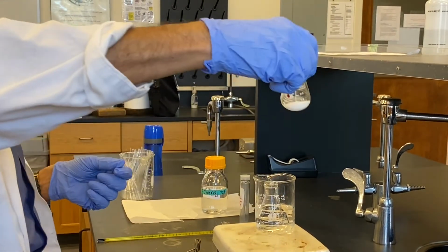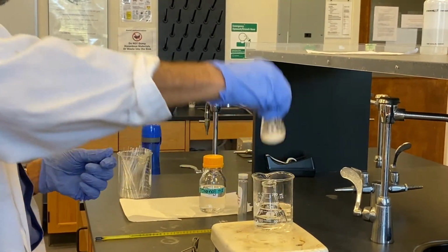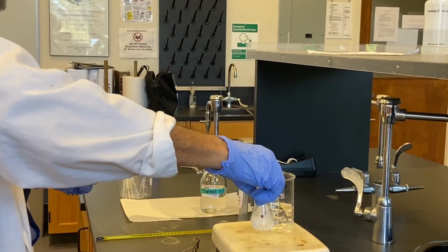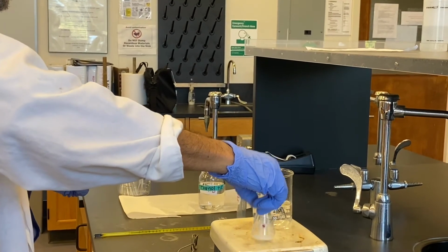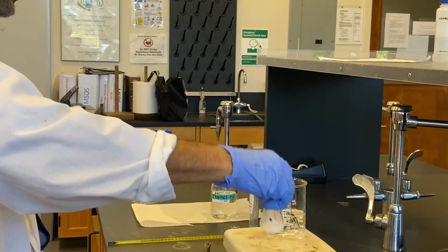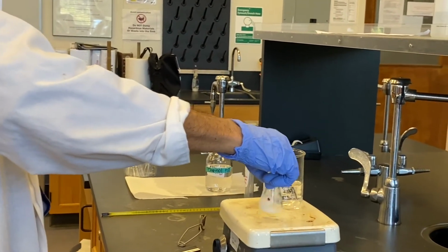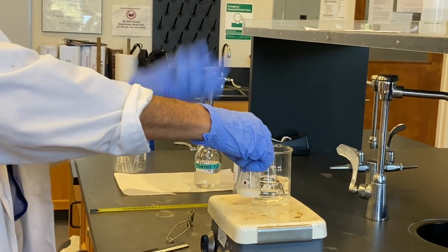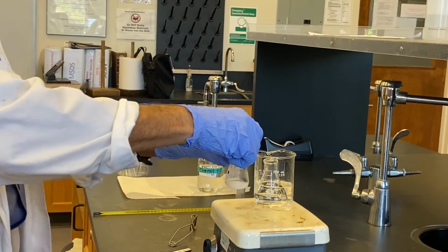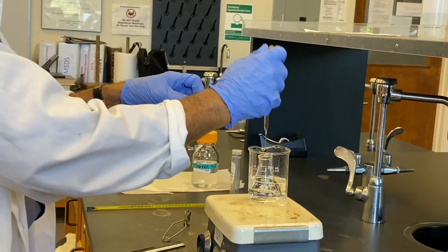Right? It is not dissolving. It's almost 1.5 ml now. It may need a little bit more solvent. So the idea is to dissolve the maximum amount of compound in a minimal amount of solvent at the boiling point. If you don't swirl it, it bumps. So you can always put a boiling chip inside, but I'm not going to do that.